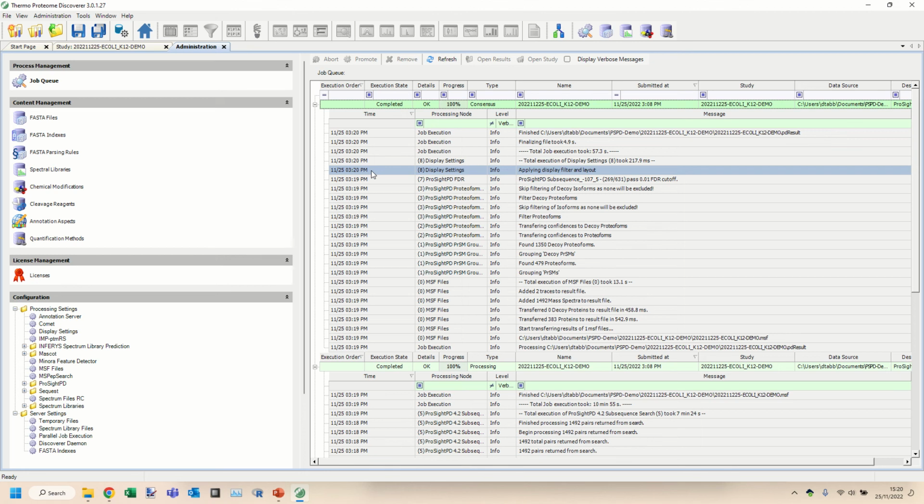What if you're dealing with a human sample where you have tens of thousands of proteins in your sequence database? What if the number of PTMs you're considering is very large? And very importantly, what if the number of raw files is larger than one and has a very high MS acquisition rate? Those things would lead to a much longer search than a simple 12-minute process.